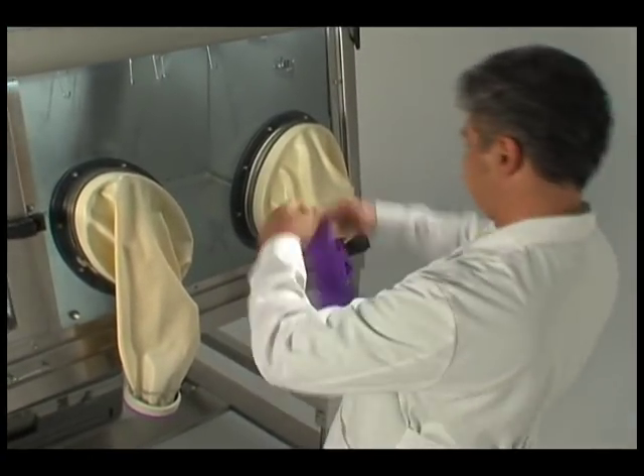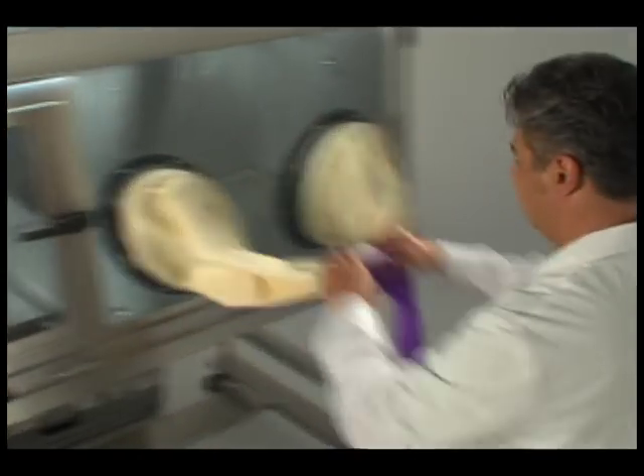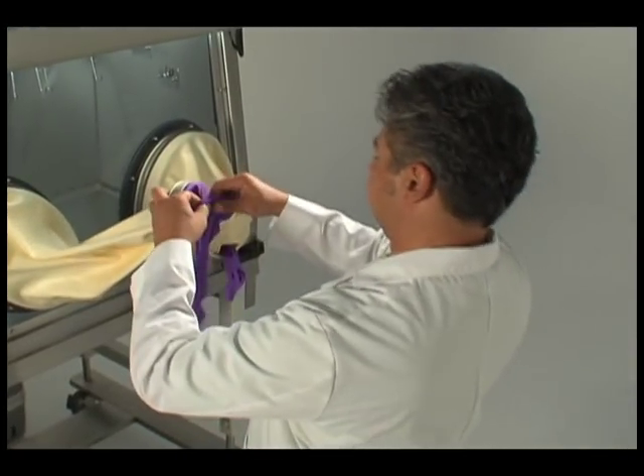Place a new glove over the old one by inverting it and gently pulling the glove cord over the old one until the cord is past the second groove.